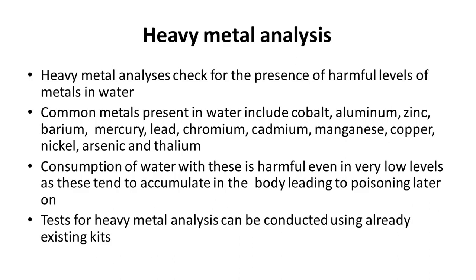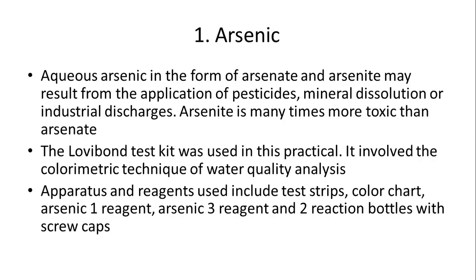Tests for heavy metal analysis can be conducted using already existing kits. Next, we'll just do the one for arsenic, because with this one we can use already established kits to tell you the quantity of the metals in water.